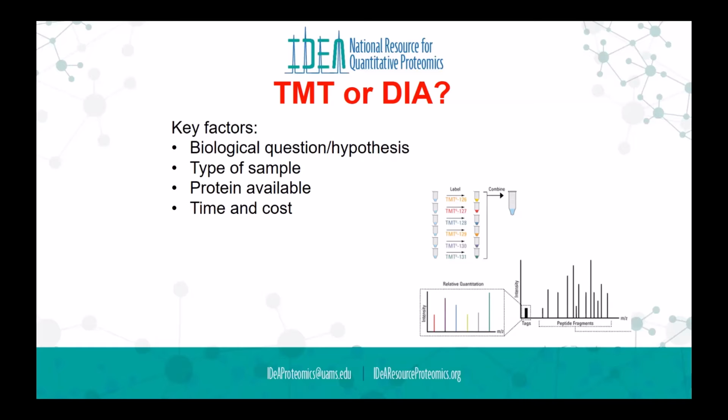So I have this salt-inducible kinase that we've already shown to be involved in sleep as well as fat storage. However, we're curious if it changes phosphorylation partners when the nematode's sleeping versus awake. So I've been trying to figure out the best way to phrase the question, as well as the type of workflow we do at the Proteomics Center we have here. Do you think you could help with that?